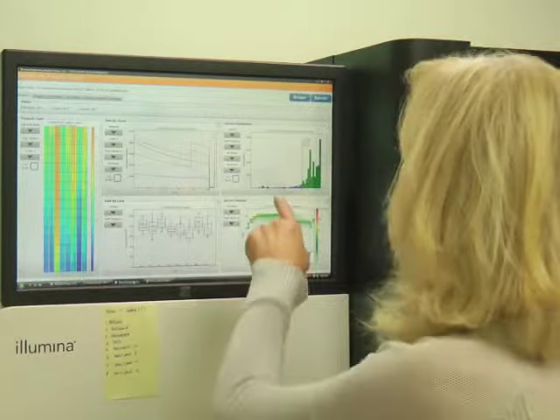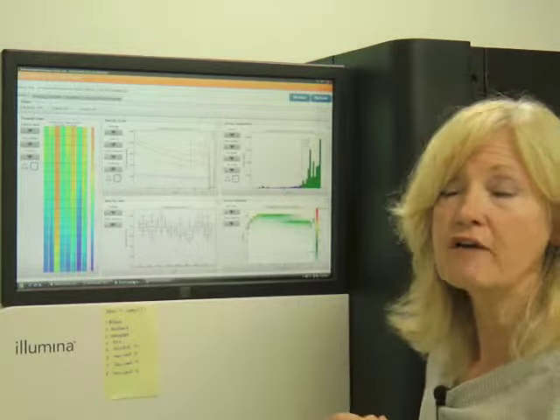So you can imagine if each cluster has approximately 1,000 different templates, we would like them all to be C at one time or G at one time, but it may not be accurately that way. So the software does what's called quality scoring, and so it is able to look at all of the fluorescence of that one cluster and say, yes, most of this would represent G or most of this would represent C. So we can see that over in this far graph here.